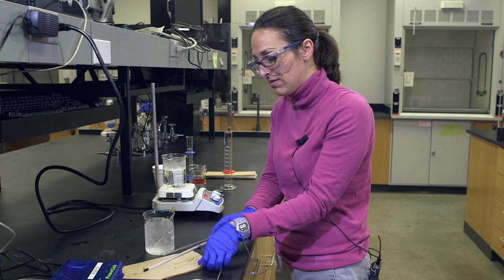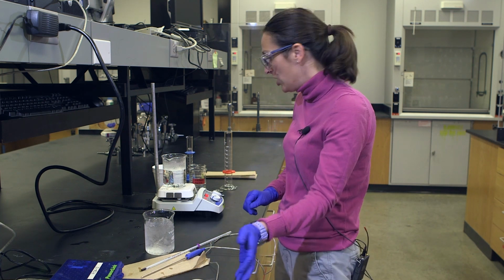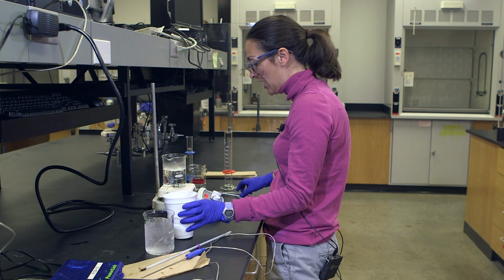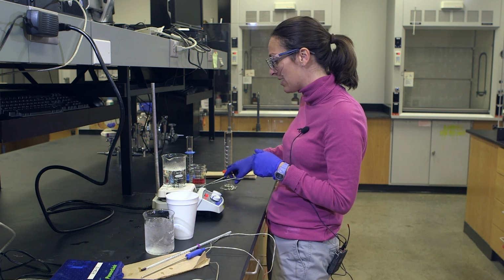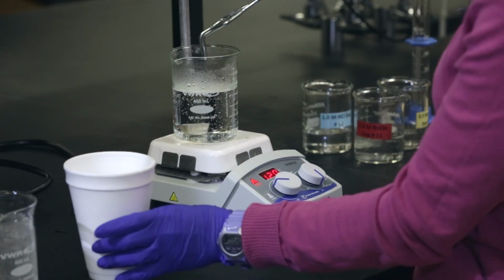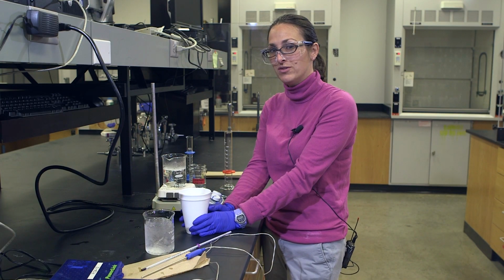Once I've calibrated my instrument, for experiment 10, you'll be measuring the heat capacity of a solution, and you're also measuring a temperature change and then calculating the heat capacity of a metal object. So I have water in my cup, my very fancy calorimetry tool.